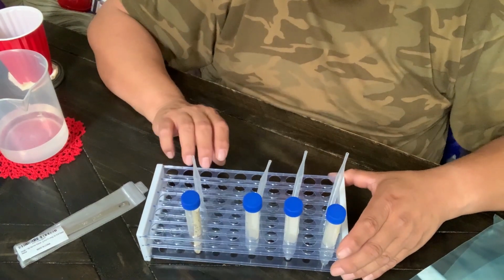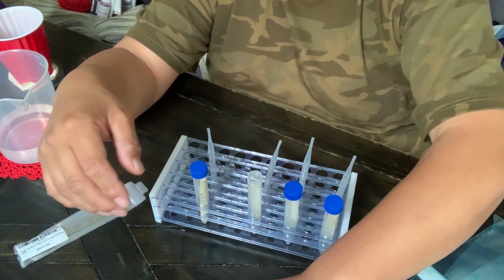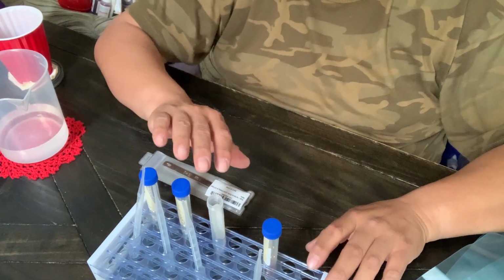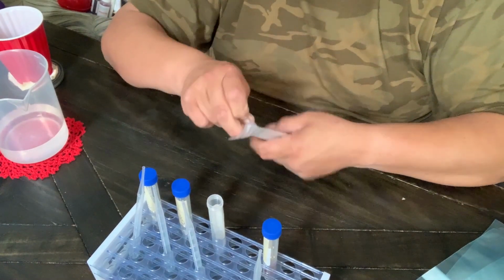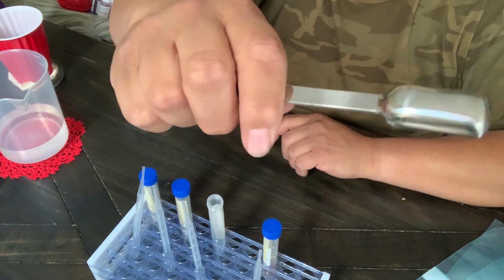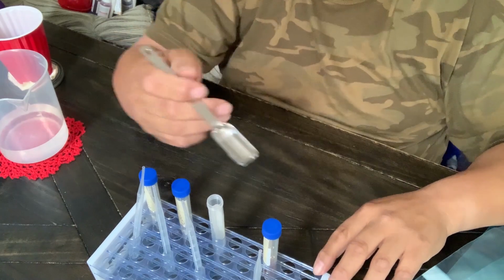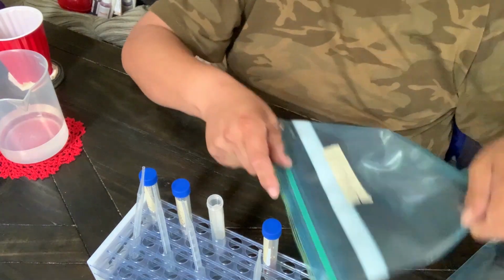All right, so we have our empty vials here. And then we need to start by getting our samples. So basically, we have to do it like this, have it all organized. And we get our spoon. All right, so here we go. Stainless steel, so there's no contamination of bacteria growing on the utensil. So we get it, find our bag that says grapes.